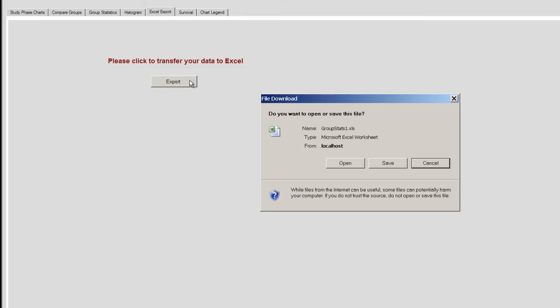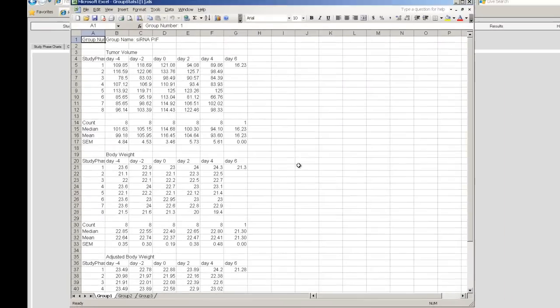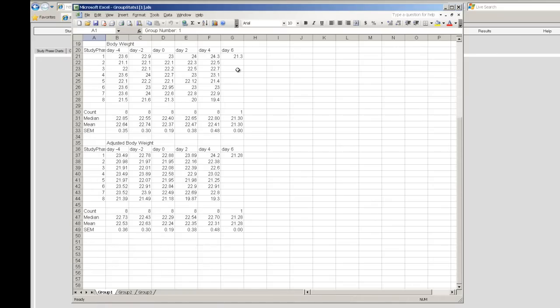And here's one of my favorite features, the export to Microsoft Excel. So with a single click of a button, you can pull your data out of the central database, and the fact that it's in the central database means that you can really lay hands on it and get to it very easily, which I'm going to show you in just a minute. But here you just click the export button, and out comes a live spreadsheet. Here's that single data point I entered for the one animal.